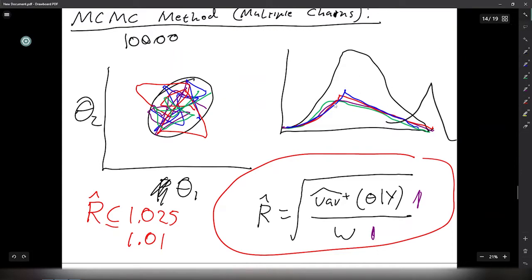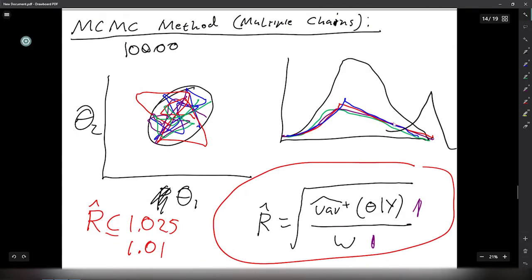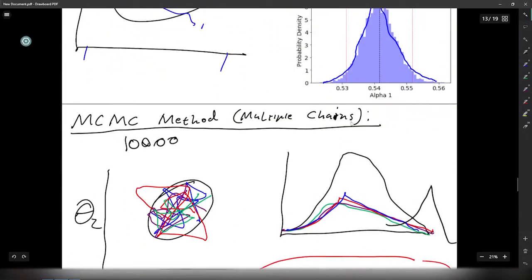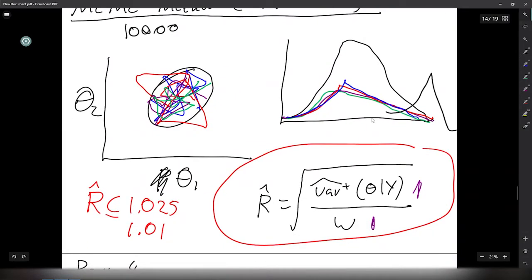So I'm going to just load up my Ubuntu system and show you how to set up inputs for BIOMEC calculating Bayesian inference, and just run you all through that, okay?